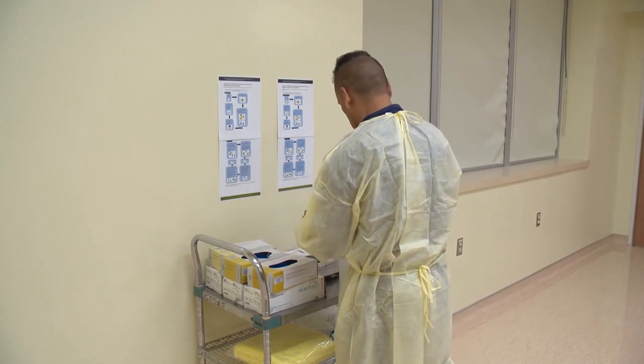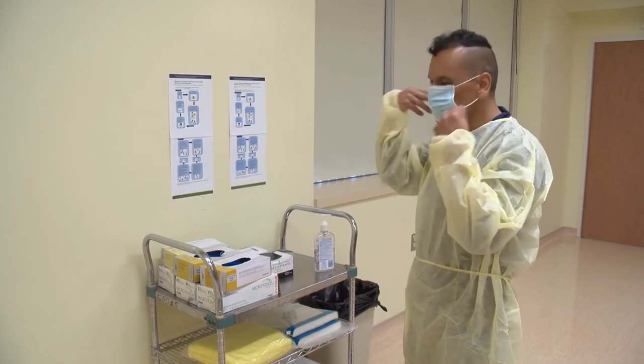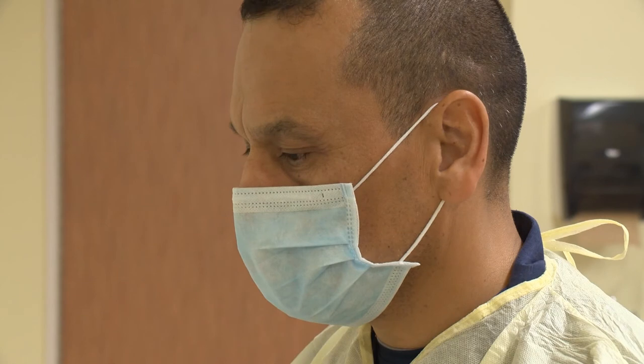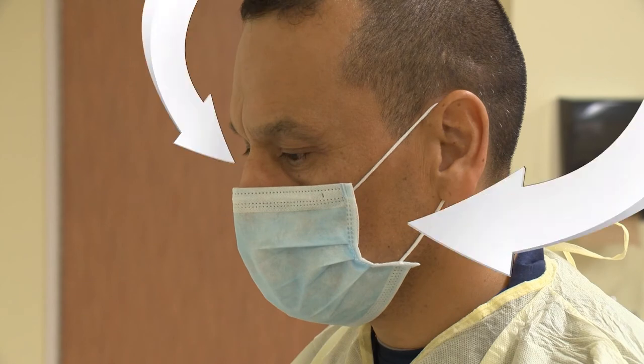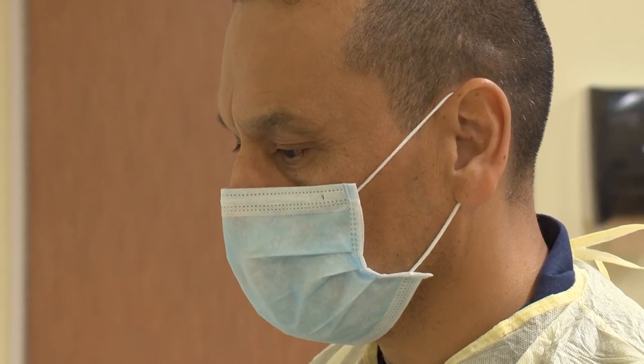Next, put on your mask. If you're using an ear-looped mask, put the loops over your ears and mould the flexible nose band to the bridge of your nose. Make sure your nose, mouth, and chin are fully covered with a minimal gap between the mask and your face.